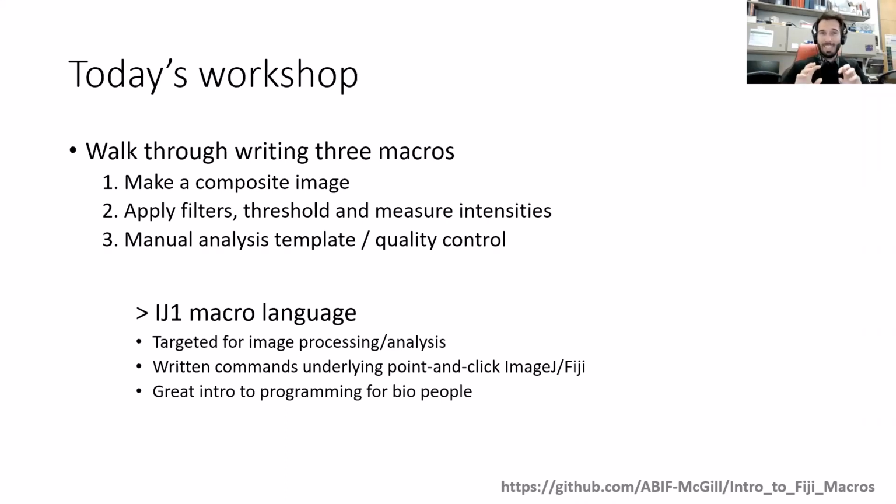Just don't do it in ImageJ. Learn Python in a proper Python environment and R in a proper R environment, because it's not quite as well supported in ImageJ, and it's somewhat frustrating to use.